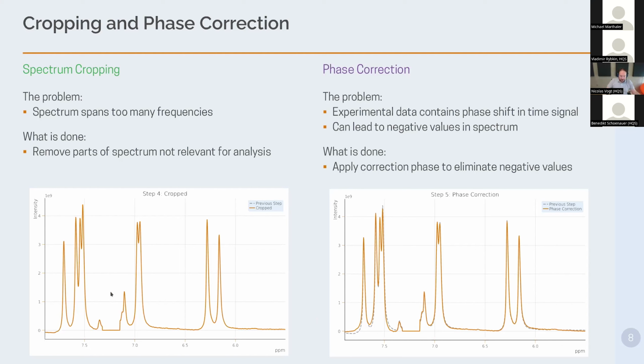parse the information. And now there are basically just two steps left in the cleanup that we need to do of the data that we read in before we can really start working with it. And one of them you can see here. So you see here, this is slightly negative. So in principle, the correct NMR spectrum should never be negative. So what you predict from the parameters is never negative.